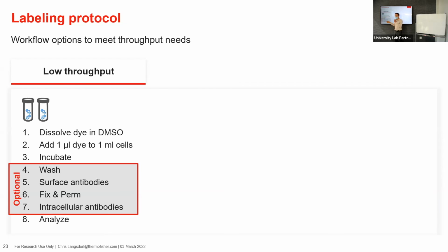And this is something I tested a lot last summer also, that it's adequate just to add the dye and go run on the instrument. Ideally, you'd wash it back out. I'd still recommend it, but you don't have to.